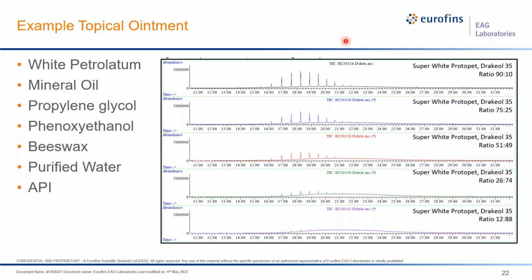Well, the first thing that we need to look at is identifying the grade of material in our RLD product. When we talk about identifying grades, what we're going to do is screen against the RLD the different grades of petrolatum, mineral oil, and beeswax that we have available to us. Generally speaking, we like to screen at least 5 of each when available. Sometimes we can't get 5 standards. Sometimes we need to look at more.